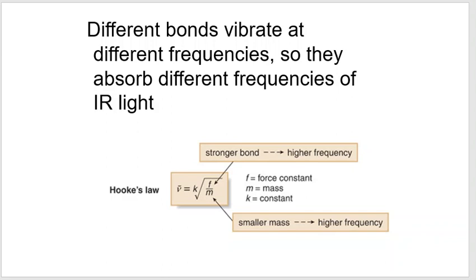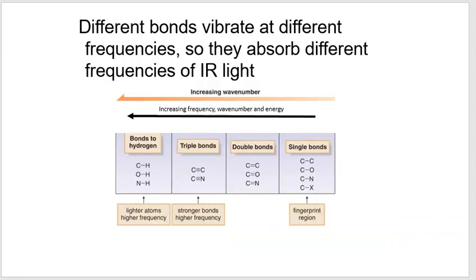So let's translate that into where we see different functional groups in an IR. CH, OH, NH bonds are going to be on the left. We've got that small proton there. And then strong bonds are also going to be on the left side of that 1500 delineation between the functional group region and the fingerprint region. The fingerprint region is filled with just single bonds that aren't CH bonds. So our carbon-carbon bonds are in that region, as well as these other ones, and they just end up being so many that it's really hard to interpret.